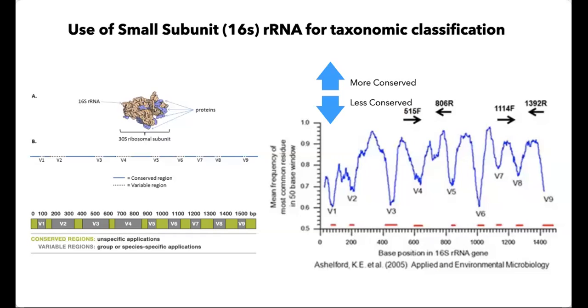This is widely used in microbiome studies, and this approach focuses on the 16S ribosomal RNA. There are approaches that sequence the complete 16S rRNA gene, but a more favorable approach is amplicon sequencing, where more than one hypervariable region can be combined to bring the target sequences to approximately 300 base pairs long.